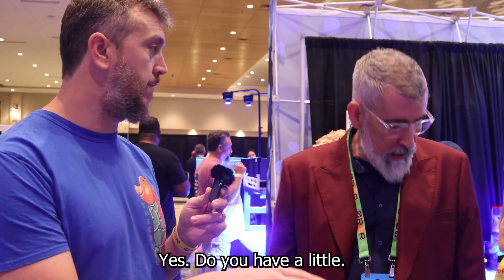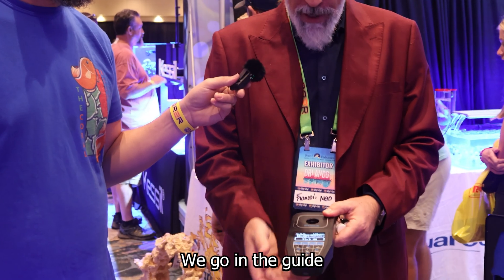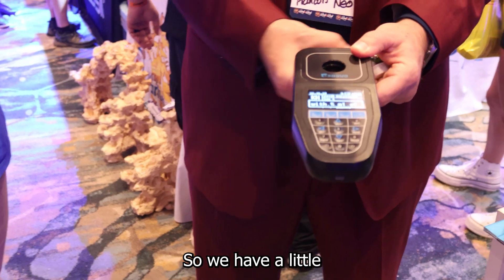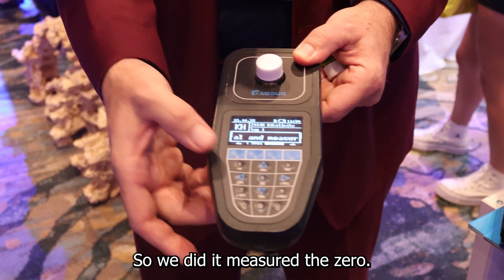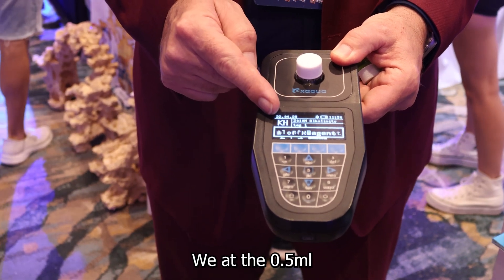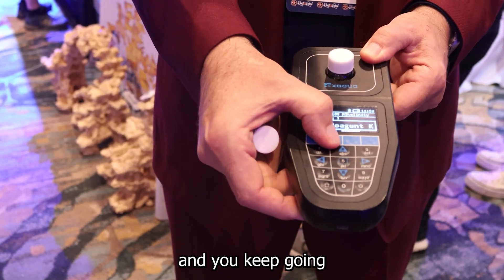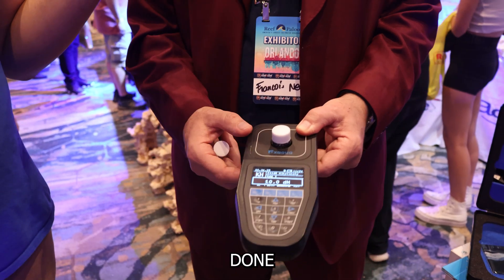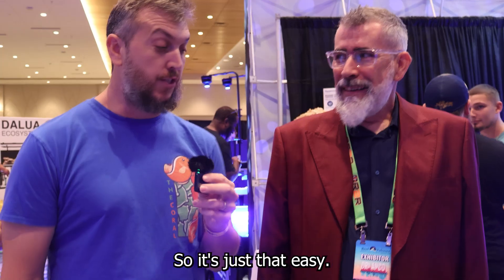Let's look at how easy it is. We have a little sample here — let's do the KH test. We go on the guide and fill the water. We put the water in and keep going. Insert the vial, then measure the zero — that's the calibration for this test. We add 0.5 ml of the reagent, put the vial back in, and it's measuring. Done. You can record it and it goes into your data. It's just that easy.